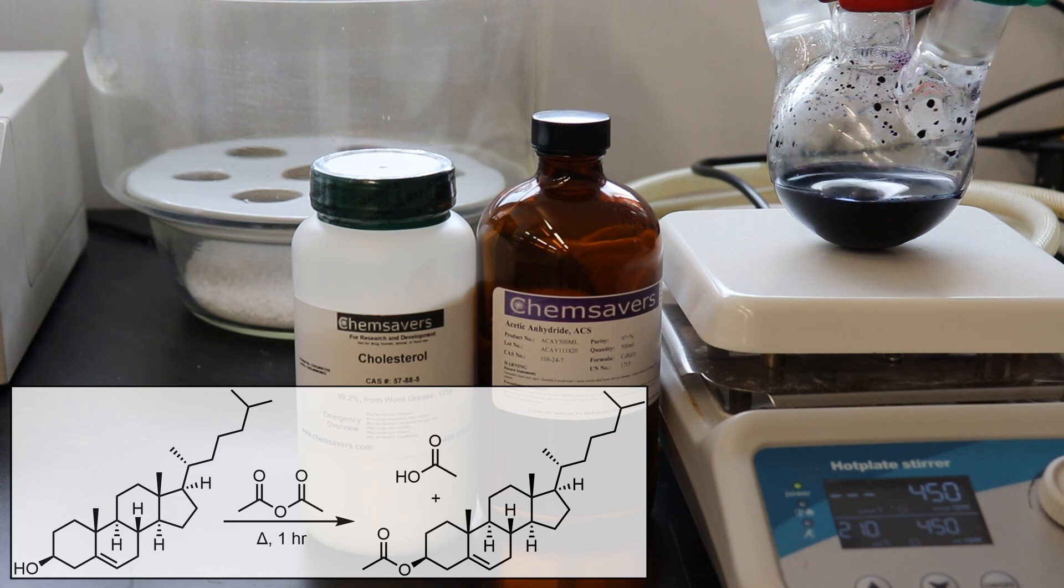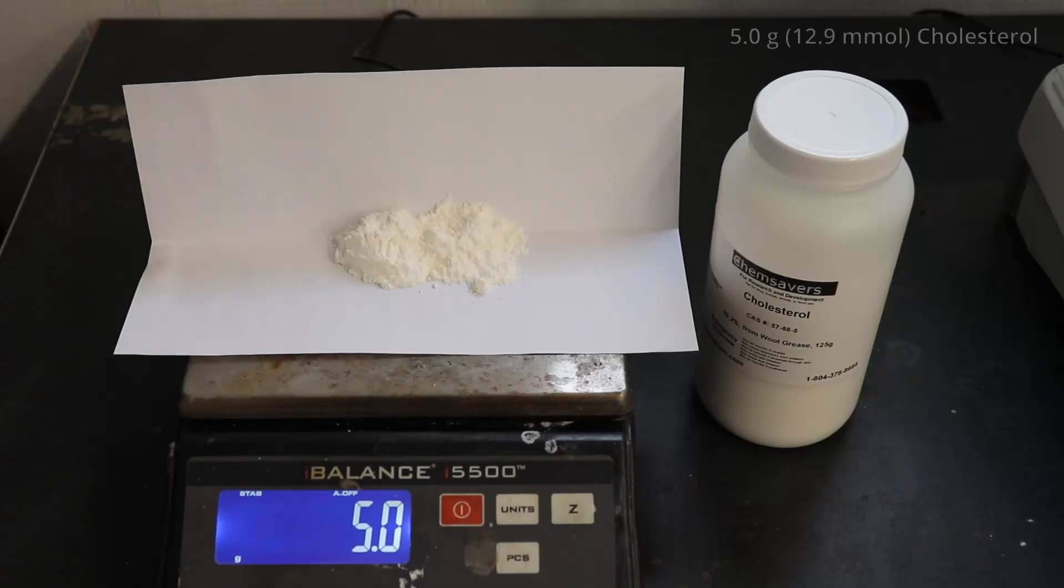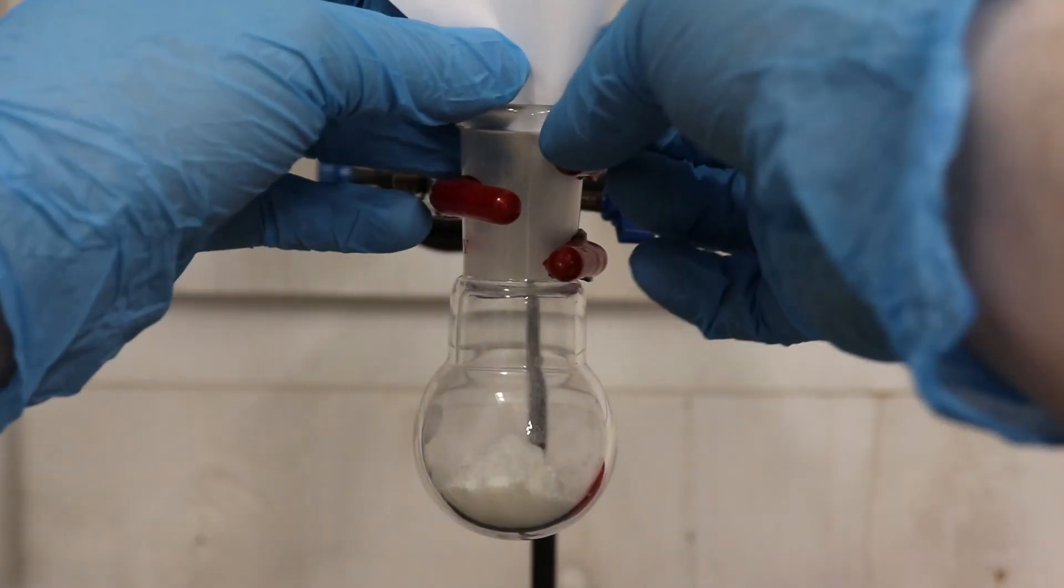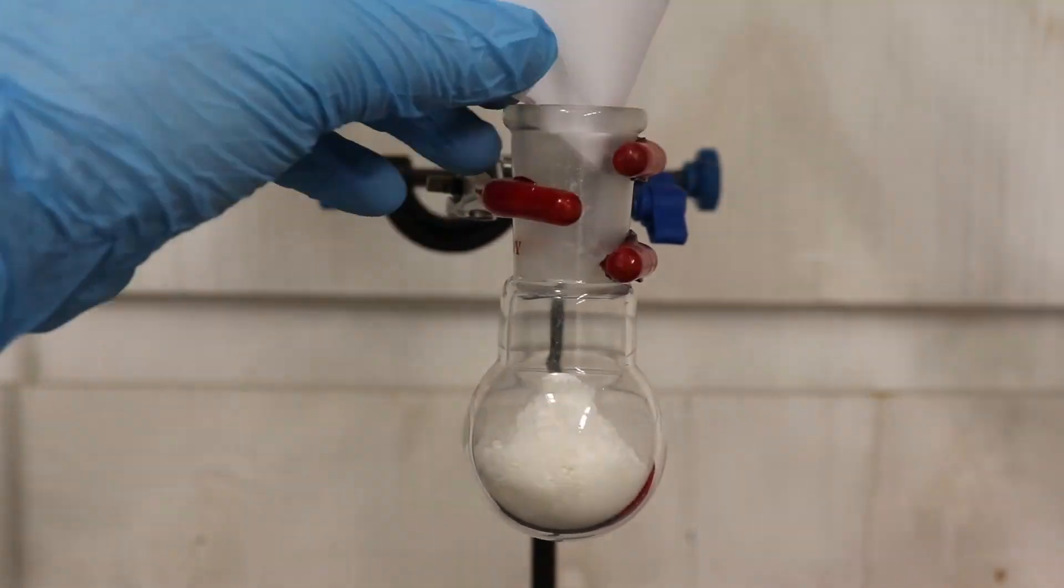However, I'm running this reaction just because I wanted to get some hands-on experience working with steroidal compounds, and this is a very straightforward reaction to start with. So, to begin, 5 grams of cholesterol was weighed out and added to a 50 milliliter round bottom flask.